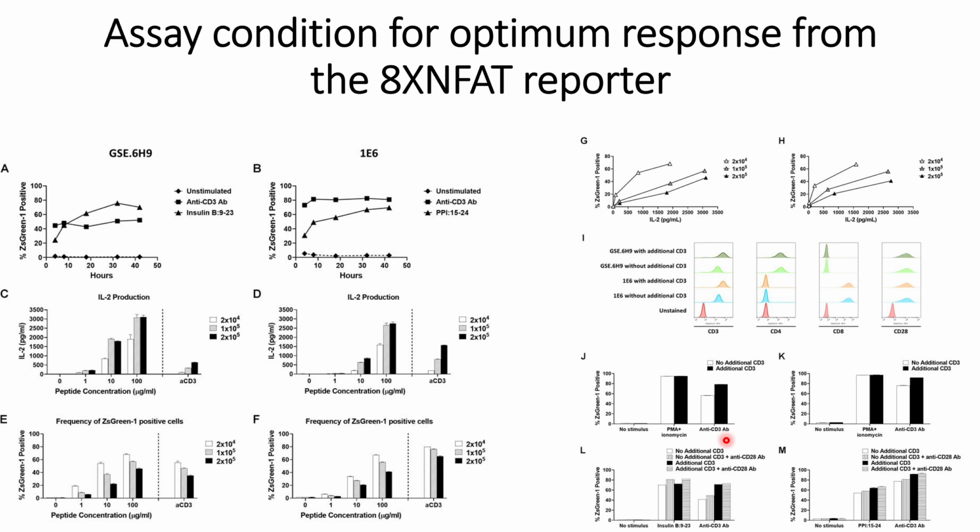And with the anti-CD3 antibodies, we can see an increase in the stimulation. And they observed similar results for the 1E6 receptors also, when they used 1E6 T cell receptors.